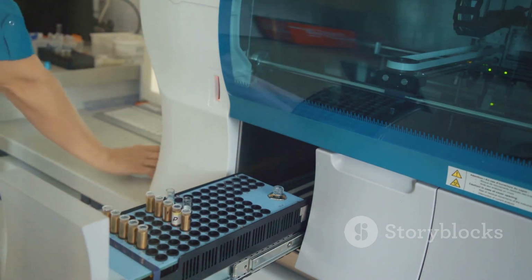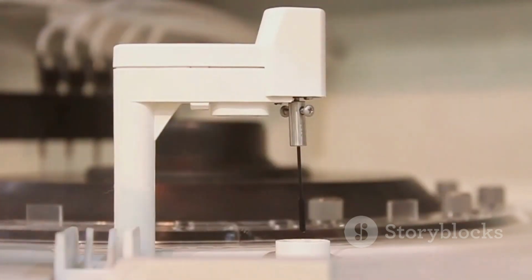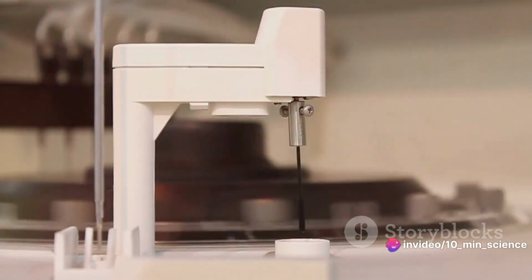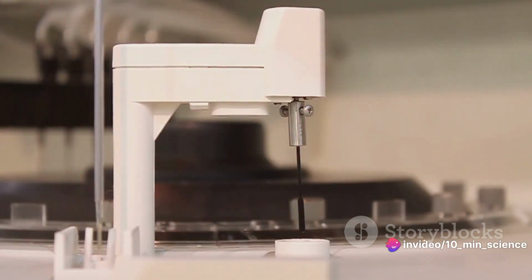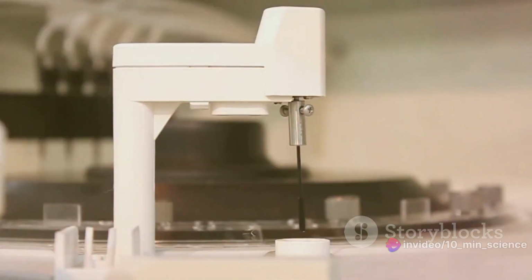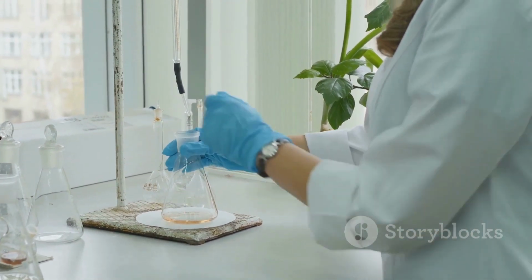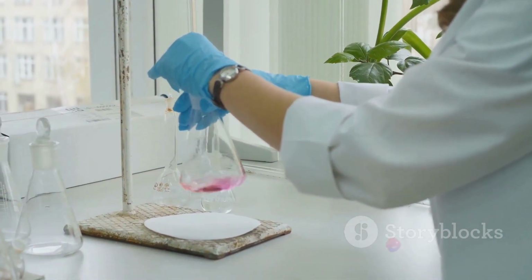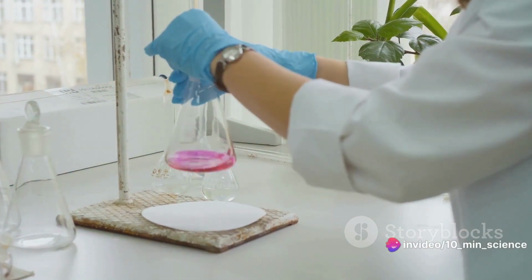Once we have our internal standard selected, it's time to prepare the sample. The internal standard is added to the sample in a known amount before the extraction process. This means it undergoes the same sample preparation and analysis conditions as the analyte, which helps to account for any potential losses during sample preparation or changes during analysis.